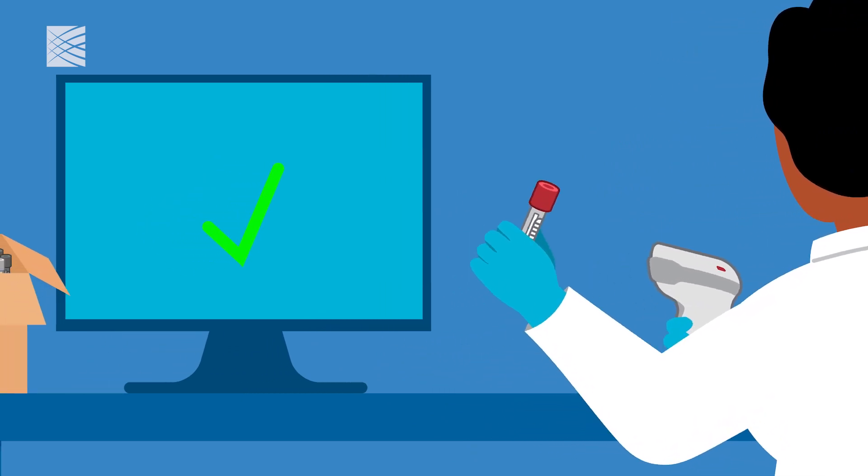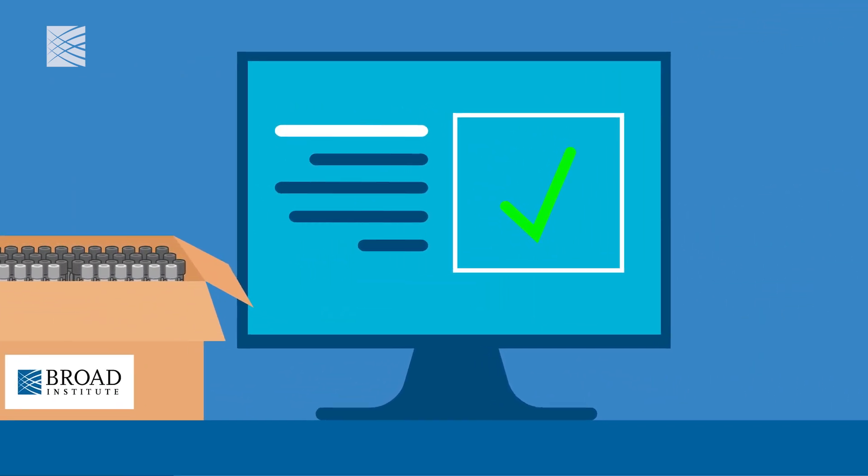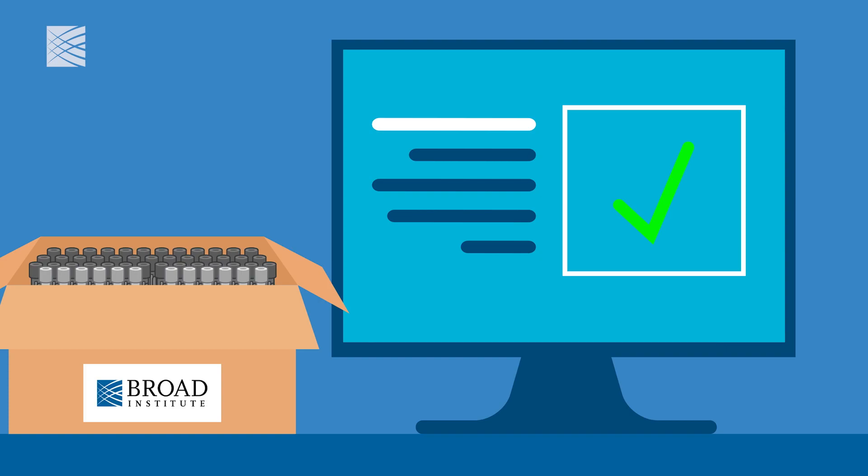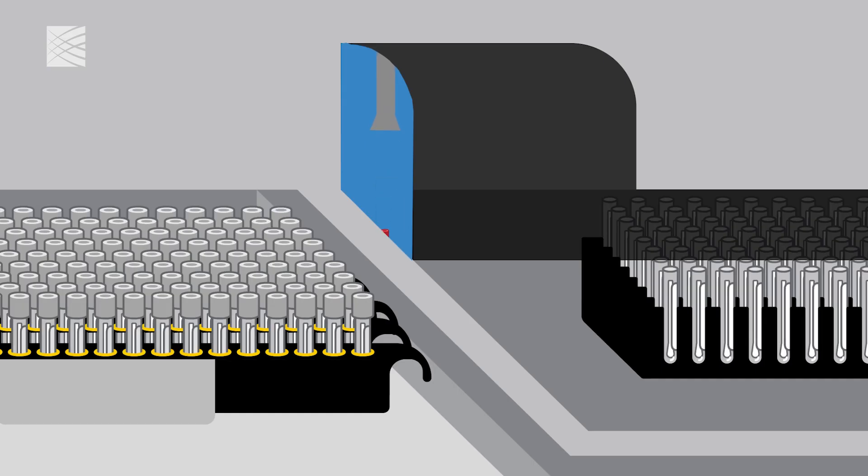The testing sites make sure that the samples are collected in a consistent way, which speeds up the processing. The samples first go through a machine that can uncap 1,200 tubes every hour.